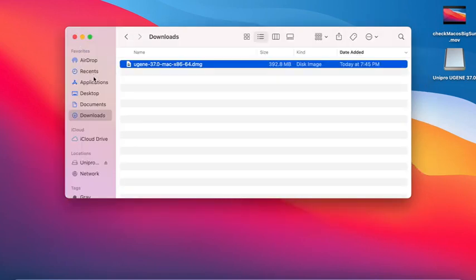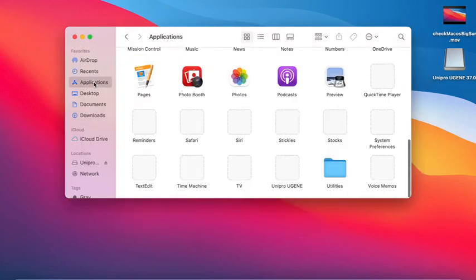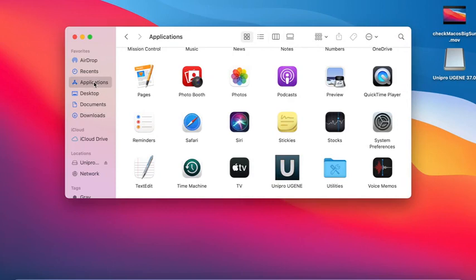So obviously now you want to go test it, and there's a variety of ways to do that, but in Finder, go to your applications window and you should find UGENE there. So if you just single click on it, let's see what happens the first time. Notice the Mac's taking a while to open it. That's because it's checking and trying to verify the installation.